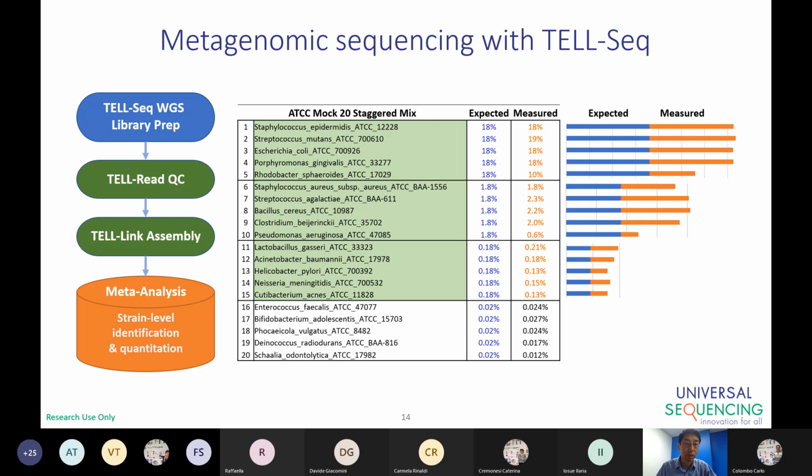Then we do further analysis on the abundance, composition, and identification, using the contigs. Our current assembler has been limited in terms of performance, to under 200 megabases. Which means for metagenomic samples, with our current approach we can only work on relatively low complexity samples. We think it's probably a sample containing no more than 40 or 50 organisms.